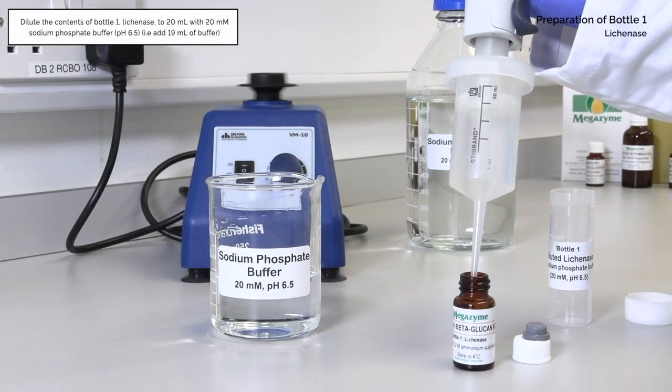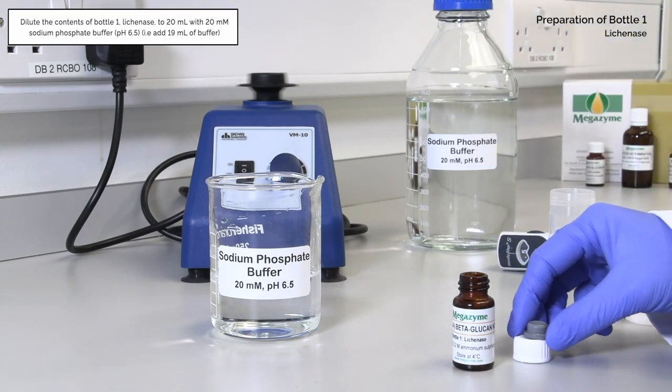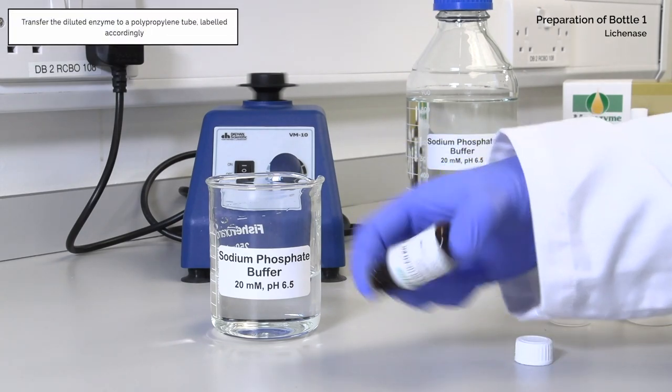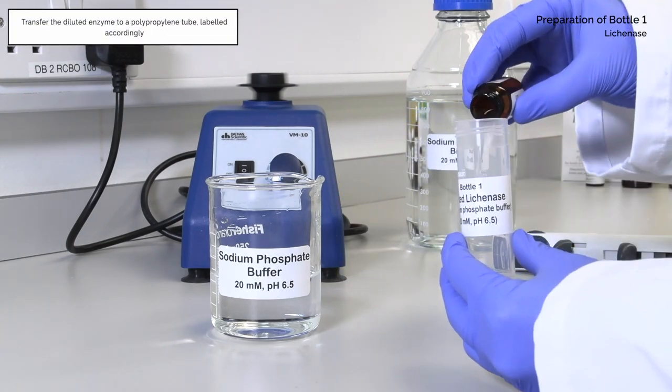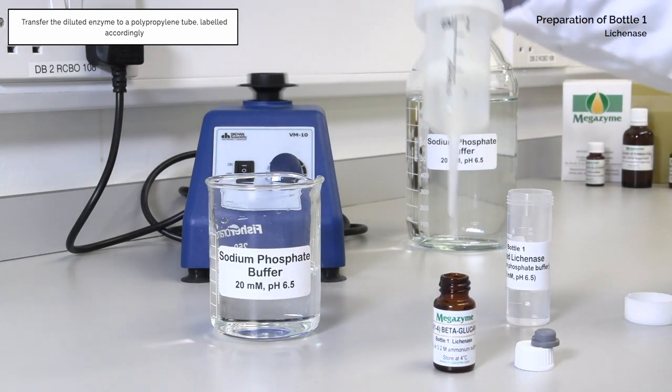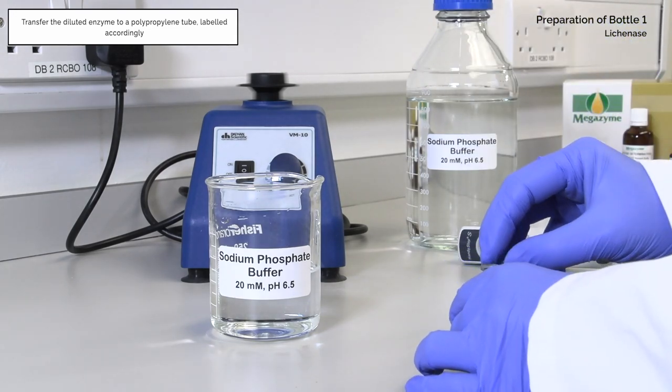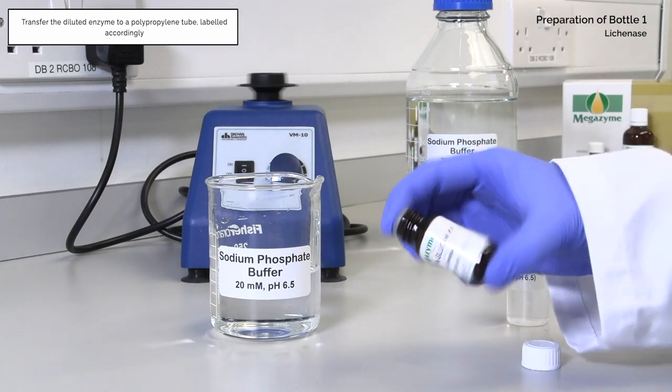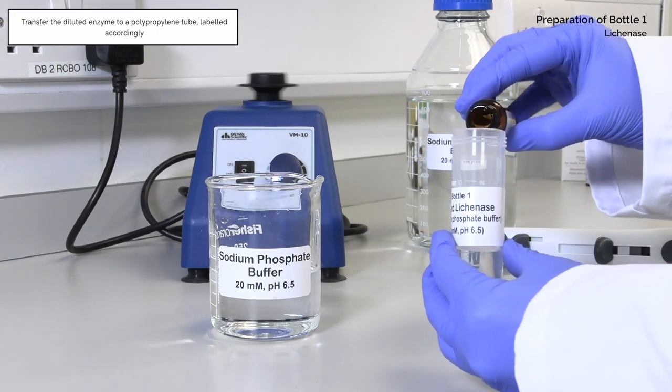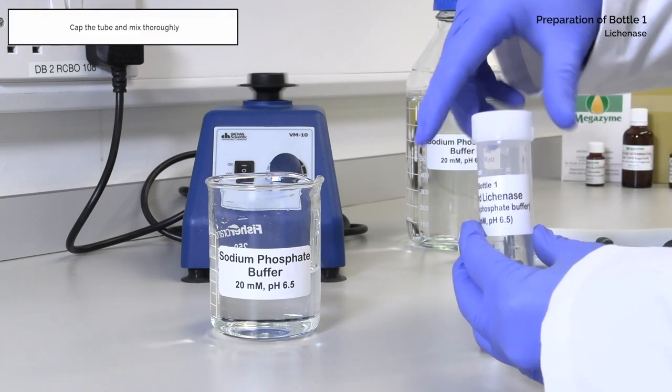The contents of bottle 1, lichenase, is diluted to 20 milliliters with 20 millimolar sodium phosphate buffer pH 6.5. The diluted enzyme is transferred to a polypropylene tube, labeled accordingly. Cap the tube and mix thoroughly.